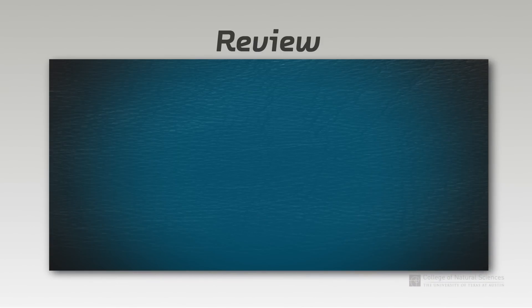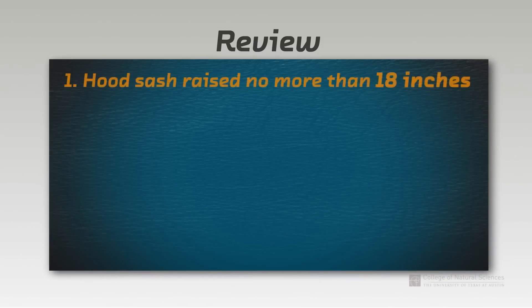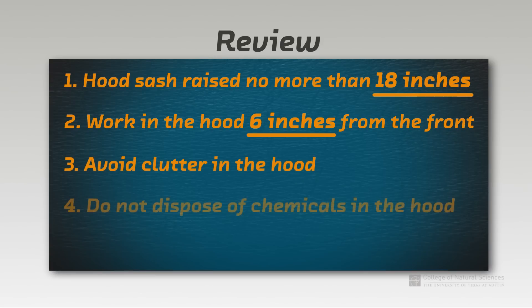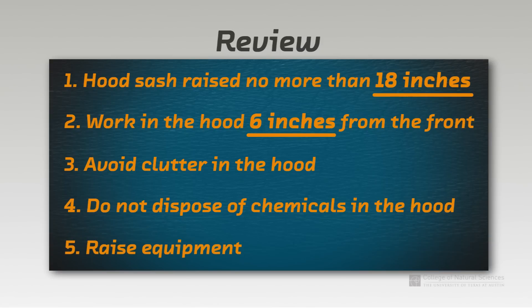To review, remember these guidelines when working in a fume hood. Remember to raise the sash no more than 18 inches for your safety and to conserve energy. Work 6 inches inside of the hood to ensure that you are not exposed to vapors. Avoid clutter in the hood including chemical bottles. Do not dispose of chemicals either by evaporation or by pouring down the sinks at the back of the hood. Raise any large equipment that is stored in the hood.